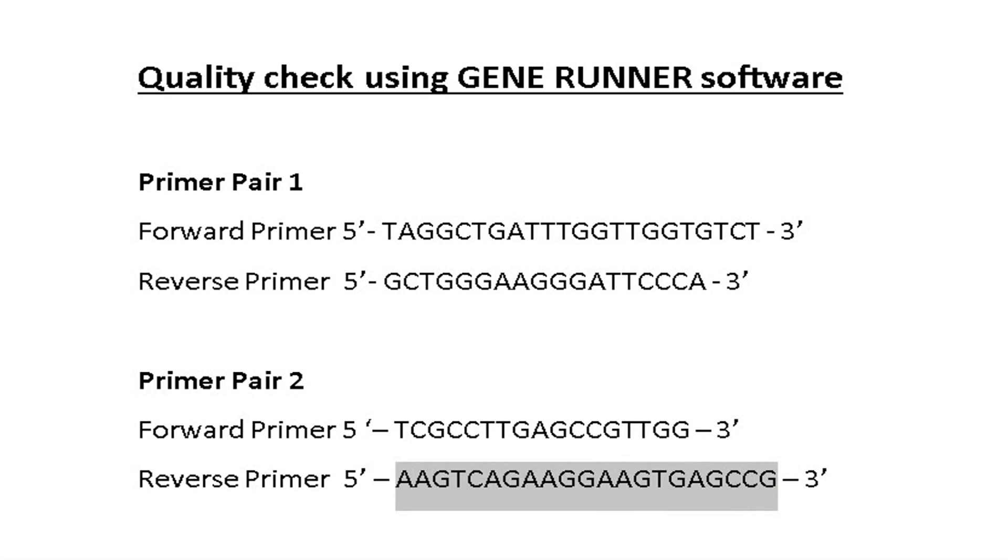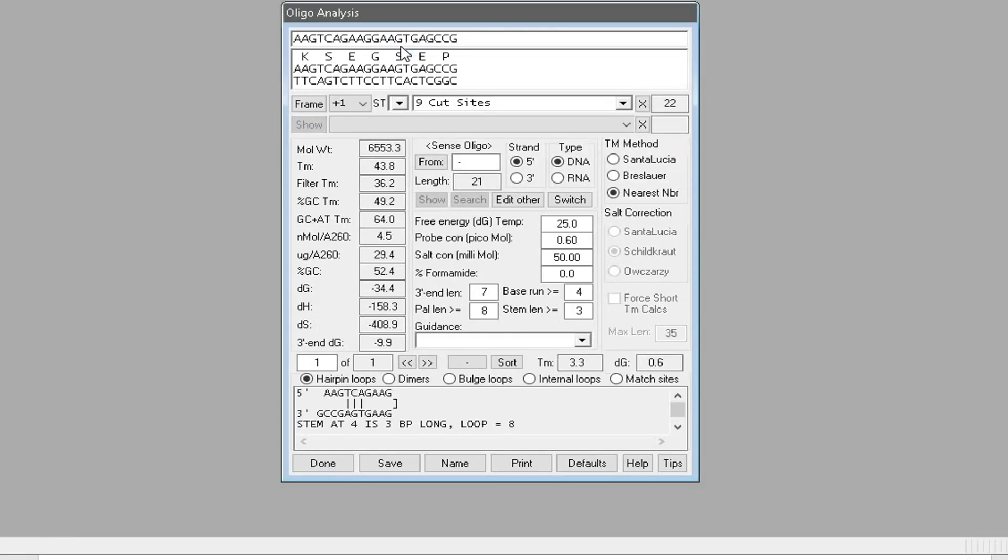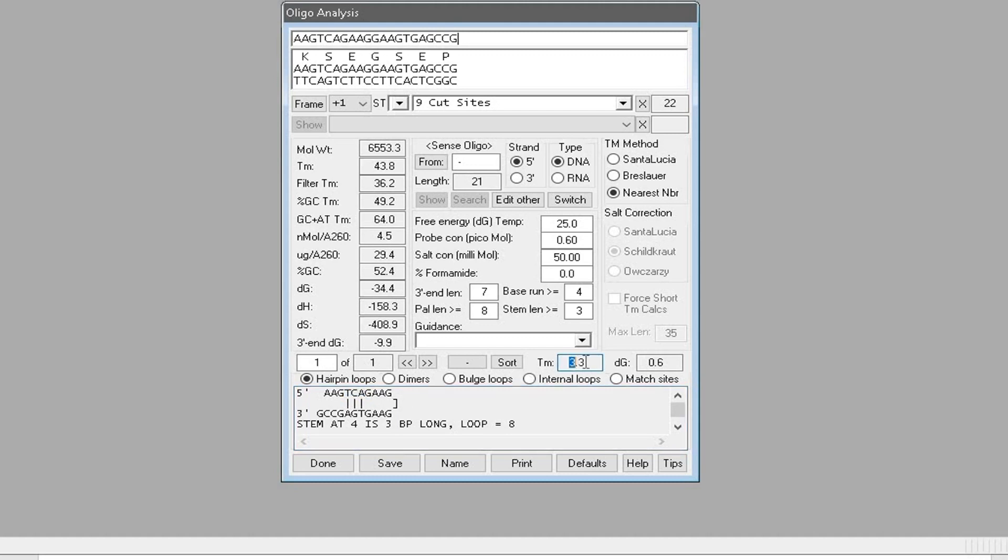To check the reverse primer of primer pair two, copy the sequence and paste it in the GeneRunner software again. The software returns the analysis with one hairpin loop for this primer sequence. However, this hairpin loop will form at 3.3 degrees Celsius.